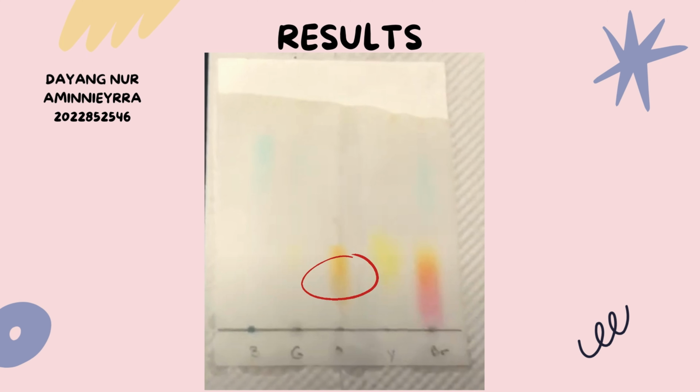Orange is a spot right here. Now we look at brown. Brown has yellow, blue, orange, and red, which of course we didn't use, so it's like brown is made up of all the colors.